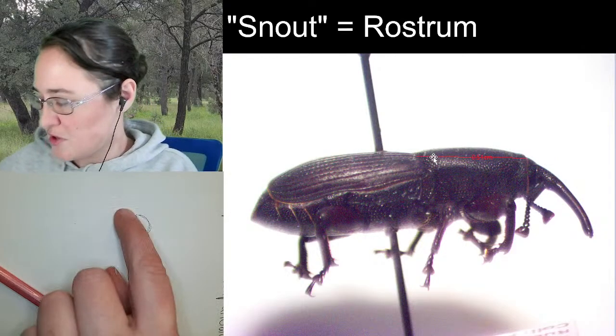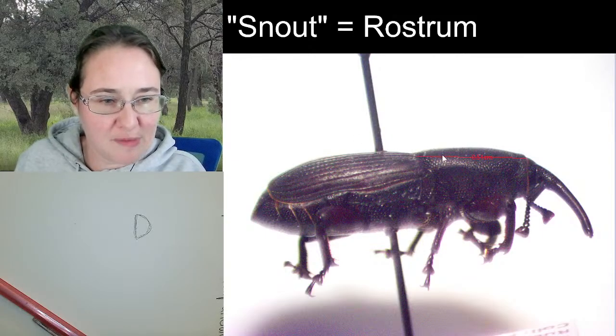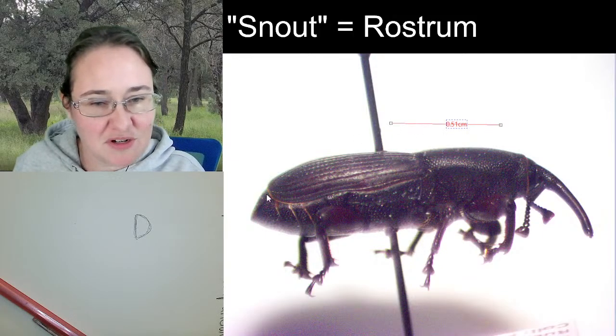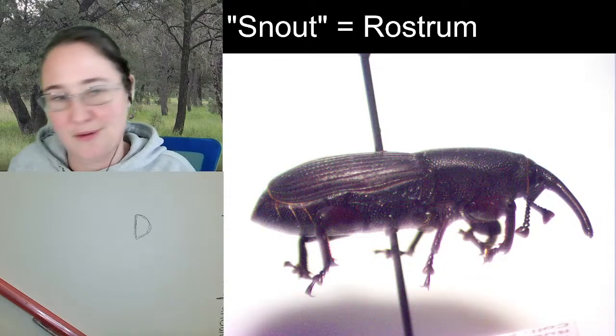So from the back of the head to where the pronotum ends, it's 0.5 centimeters. I was hoping that was going to help us a little bit with the ratio, but it doesn't really help too much.